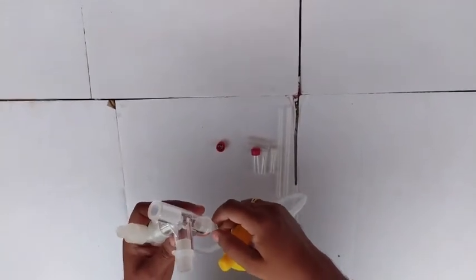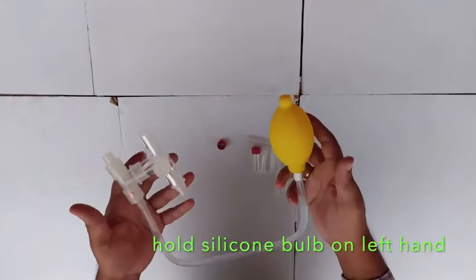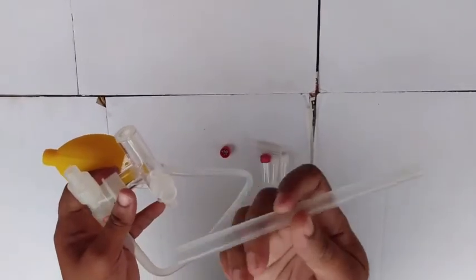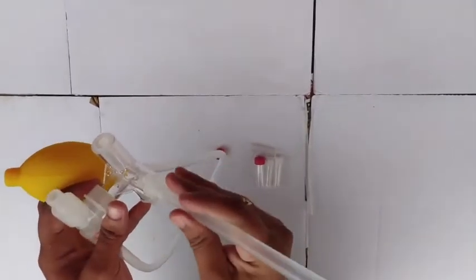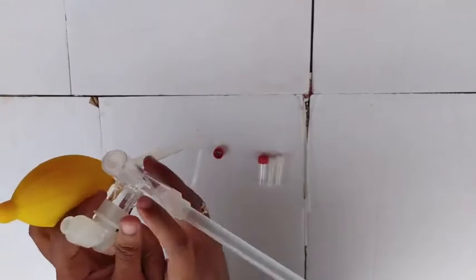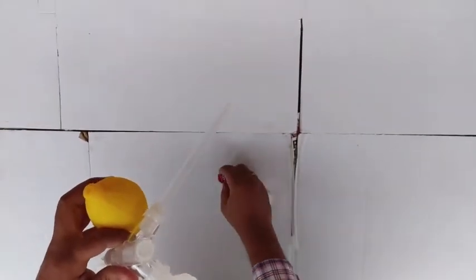Now I'll demonstrate what you will receive in the package. You will receive these items — this is the 12mm opening aspirator tube, which you can fix in here. The collection vial comes with a removable cap, which you fix in here too.